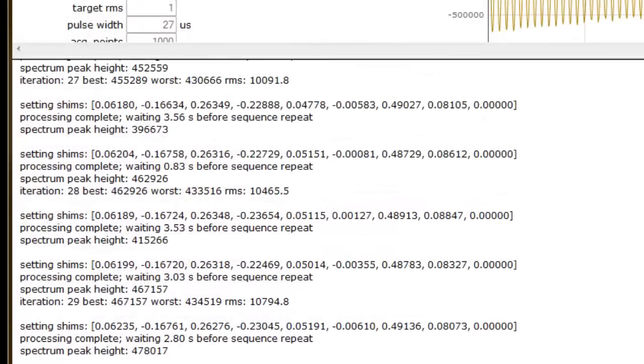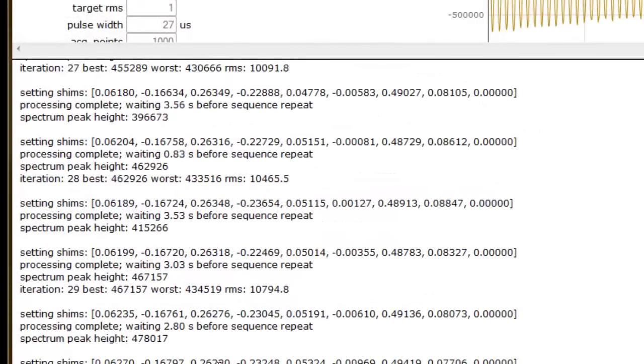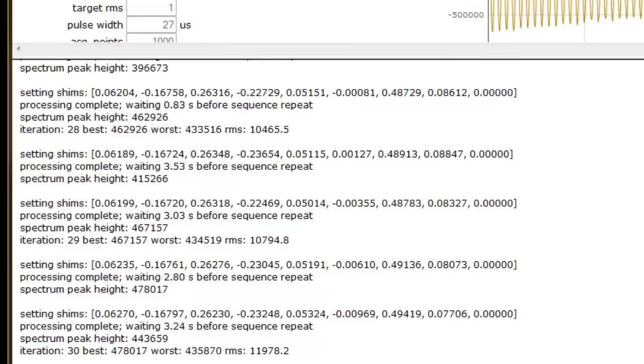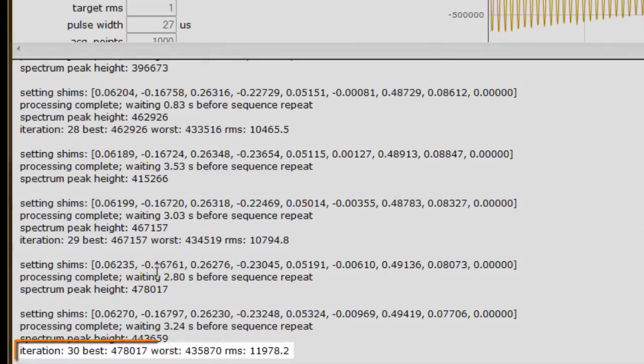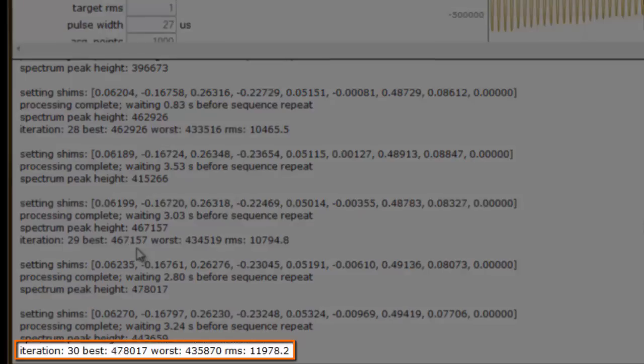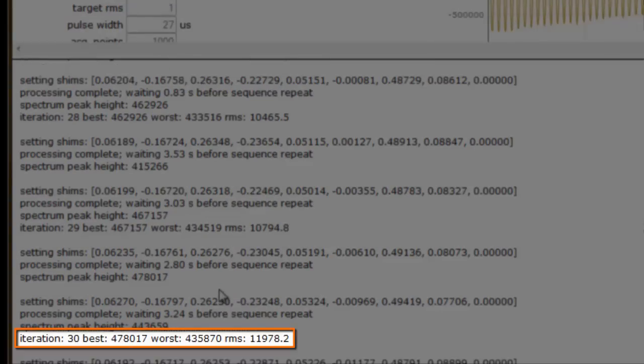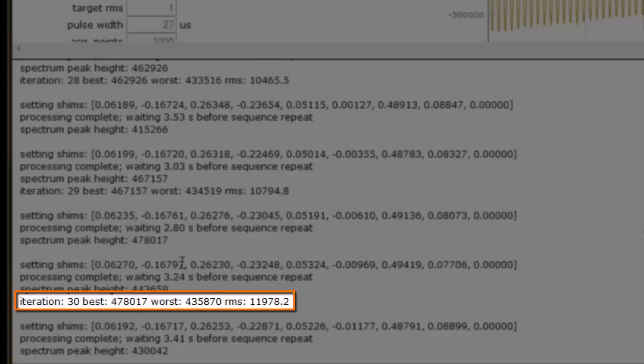Let's check the progress of our shim so far. We started at a spectrum peak height of approximately 455,000, and now we're at approximately 478,000 after 30 iterations. For my instrument, the goal is a relaxed spectrum peak height of around 550,000.